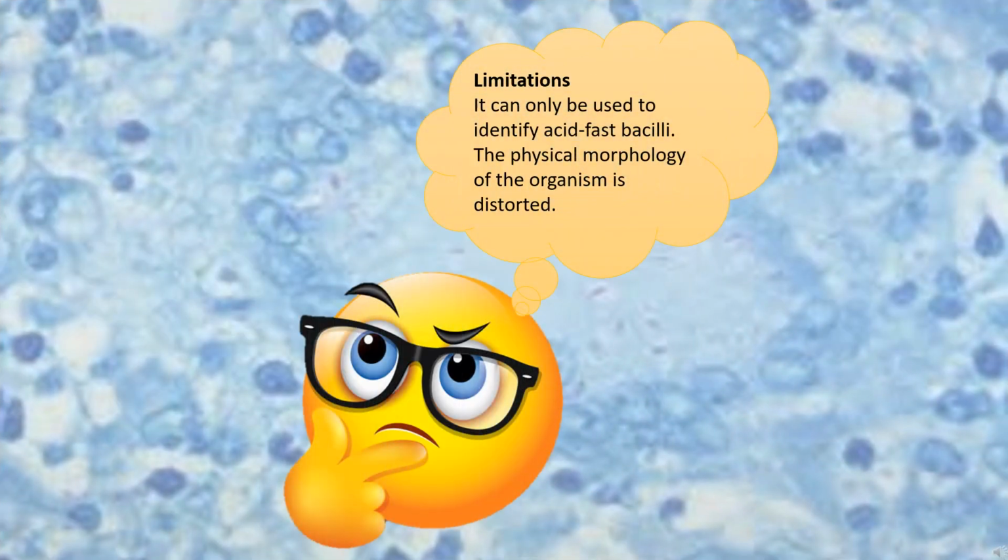Limitations of Ziehl-Neelsen staining are, it can only be used to identify acid-fast bacilli, and the physical morphology of the organism is distorted.